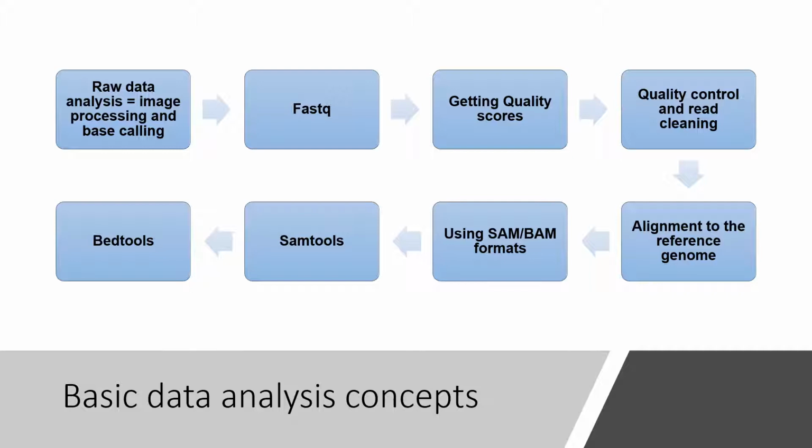The results obtained using bioinformatics tools like Bowtie and BWA are in .sam files. These .sam files can be converted to binary formats using SAMtools. Once they are in the binary format, they can be sorted and then indexed. Then by using another bioinformatics tool called FreeBayes, these sorted, indexed BAM files can be used to generate a VCF file.